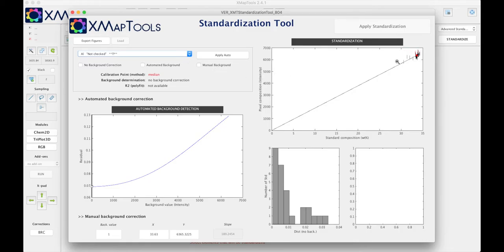For aluminium we see that we can define the calibration curve, the black curve going through zero zero. If I press apply auto it just applies this calibration curve.